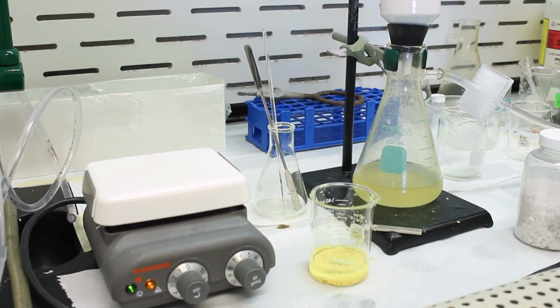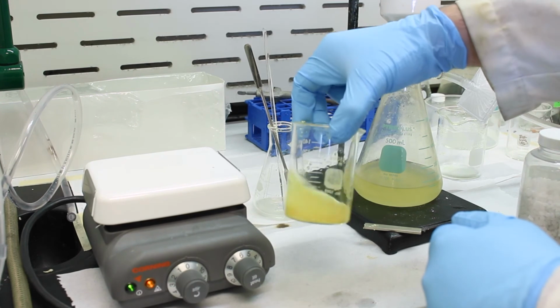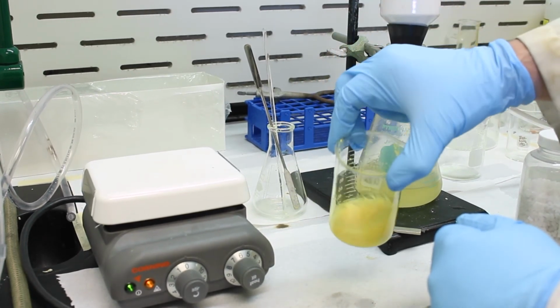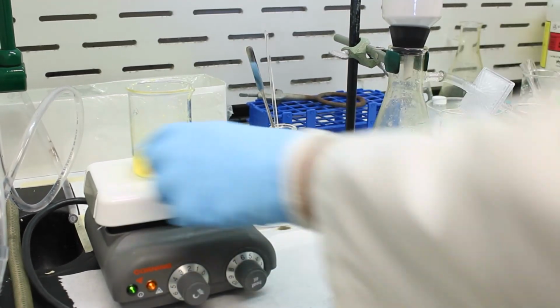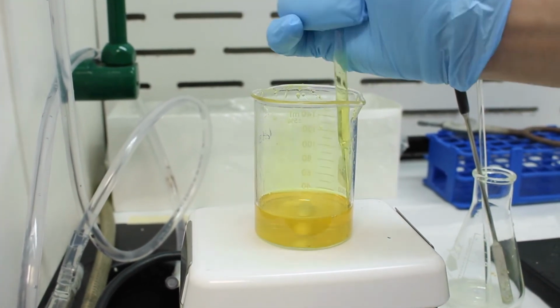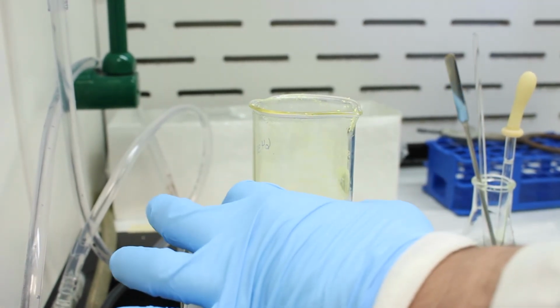In recent years, we've had trouble getting this crystallization to work for various reasons, so hopefully this works out. So we'll also try another technique. We'll seed it. We'll show you that is we'll seed it when we take it off the heat. So place it on there. We'll turn on the stirring, help it dissolve. So that dissolved quite easily.